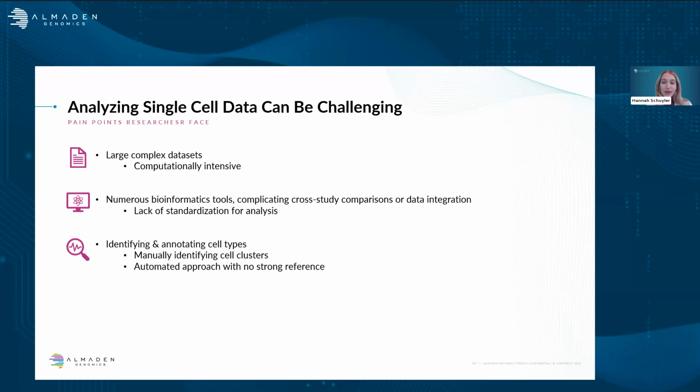And then lastly, being able to accurately identify and annotate cell types is a very time-consuming process, which I'm sure if you are working with single-cell data, you're very familiar is sometimes a tedious process. Clustering of the cells really doesn't mean anything if you aren't able to identify and annotate what those clusters are.